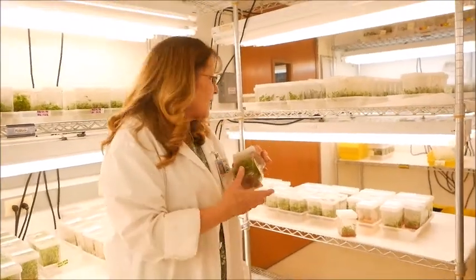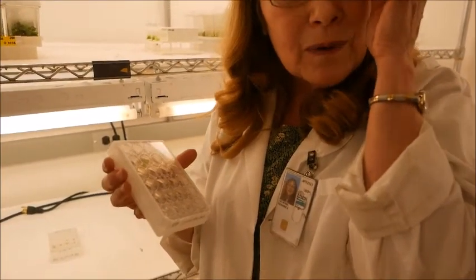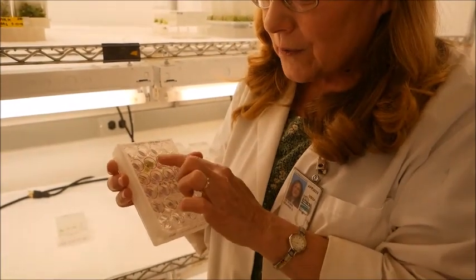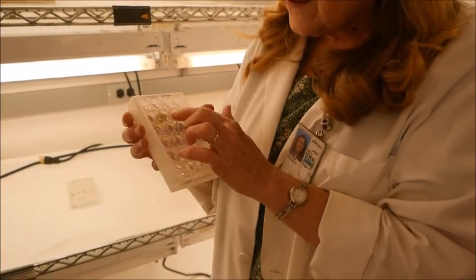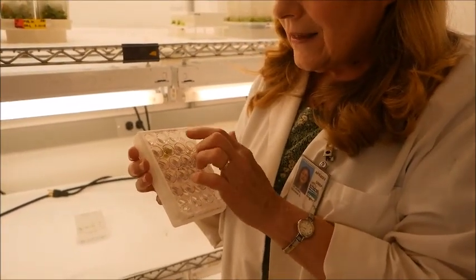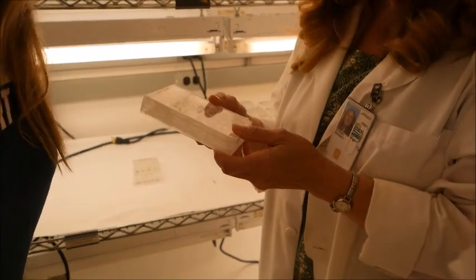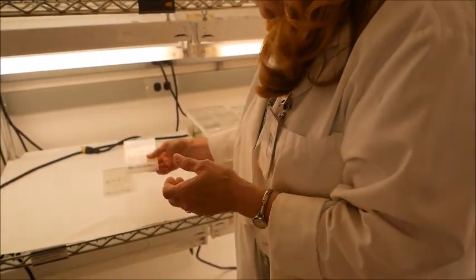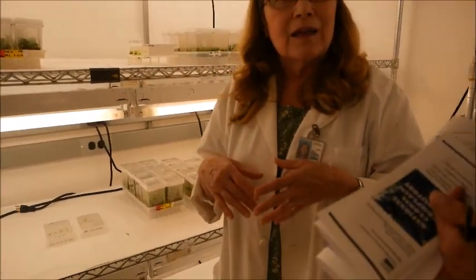There's an auger on the bottom. I use a microscope — a good microscope — and very sharp tools, and steady hands, no caffeine that day. These we hope will have escaped the virus. So that's the goal. We will take them back out to the greenhouse and use appropriate methods for testing for the presence of that particular virus, since each virus is a little bit different.